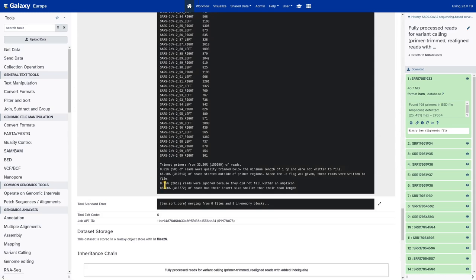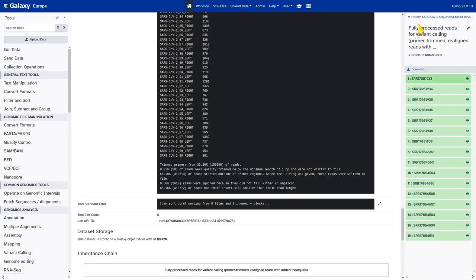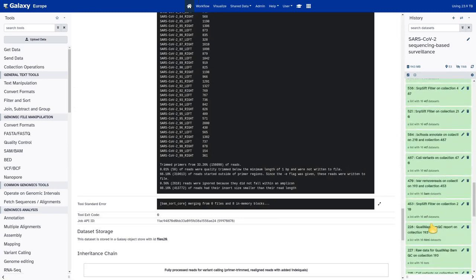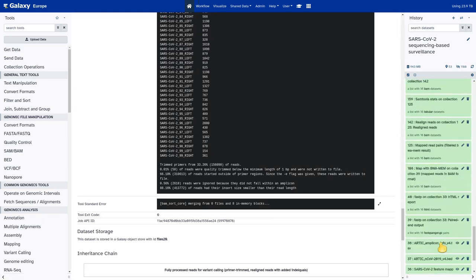So only about a third of the sequences need primer trimming here. The remaining 66% of reads started outside of primer regions but probably inside amplicon regions, and we want to keep those reads. What we want to drop are reads that really did not fall within an amplicon at all — those would contradict what we assume based on the amplicon info and primer scheme. If we find many pairs of reads extending outside of amplicons, we should worry that we're not assuming the correct primer scheme. However, there's not much to worry about here — just 0.56% of reads did not fall within an amplicon, which is probably just sequencing artifacts or a bit of unamplified original genomic DNA. If this number goes up to several percent or tens of percent, chances are you're using the wrong primer scheme.